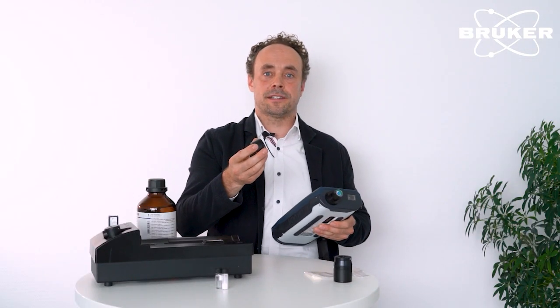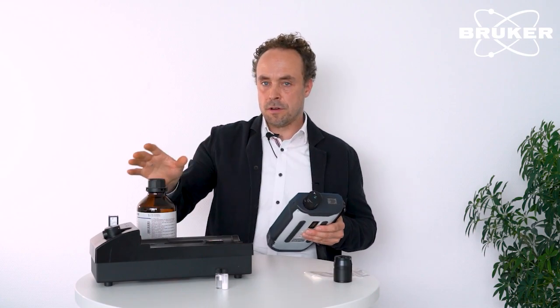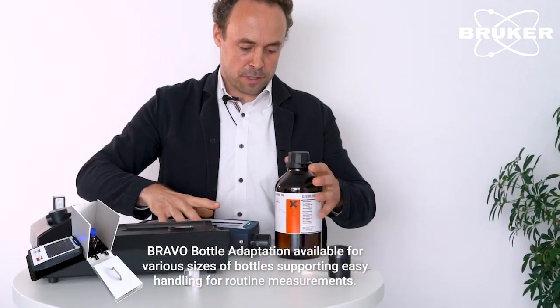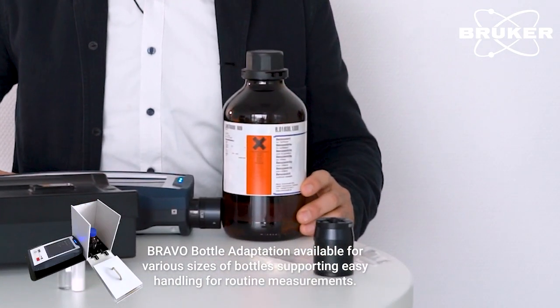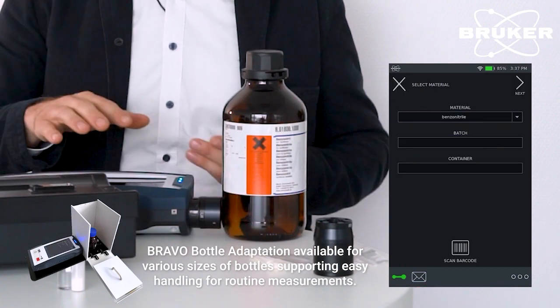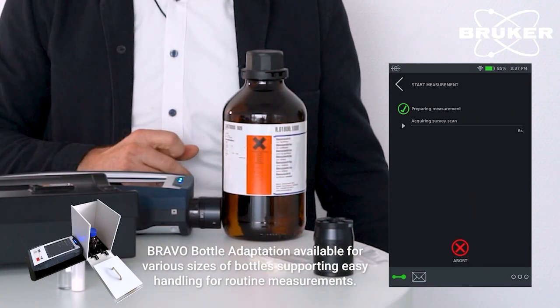This is, for example, an adaptation to measure through thicker-walled barriers. For example, through an amber-colored glass bottle. Here I have a 1 liter bottle of benzonitrile. I'm just aligning the instrument in front of the bottle, start the verification workflow, specify my material, and press start.